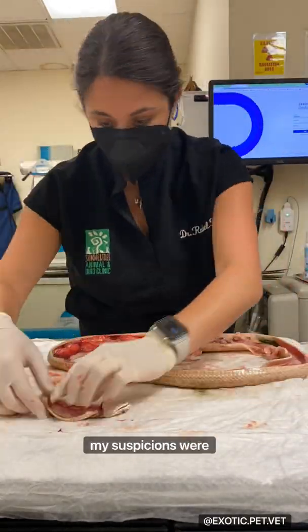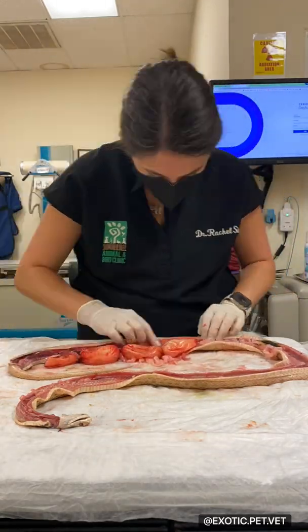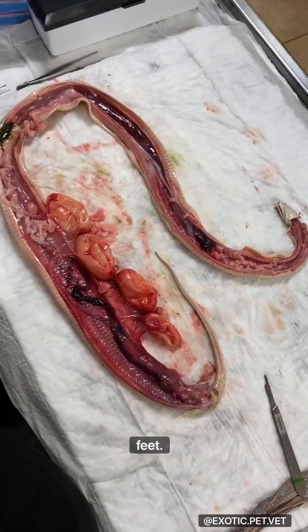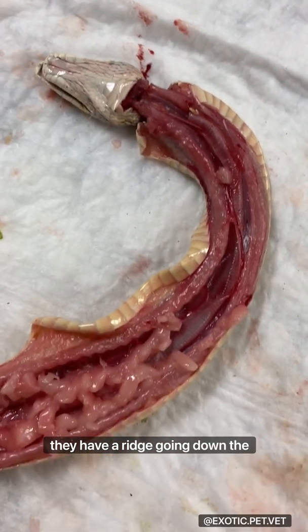As I opened her up, my suspicions were confirmed. Bull snakes are some of my favorite snakes. They are a subspecies of gopher snake and one of the largest colubrids in North America, reaching lengths up to eight feet. Their scales are keeled, which means rather than being smooth, they have a ridge going down the center.